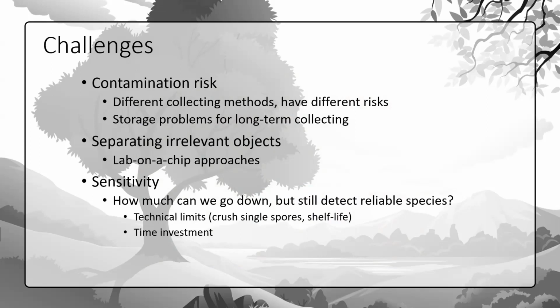A filter, for instance, has the problem that as soon as you touch something while the device is collecting, you start to collect it. It's not wise to stand right in front of the device. You can do it and generate positive results, but where's the fun in it? And of course, if you do long-term collecting, you have the issue of how to store the filter, so that it's not degrading before you recollect your filters or the liquid where it was stored.